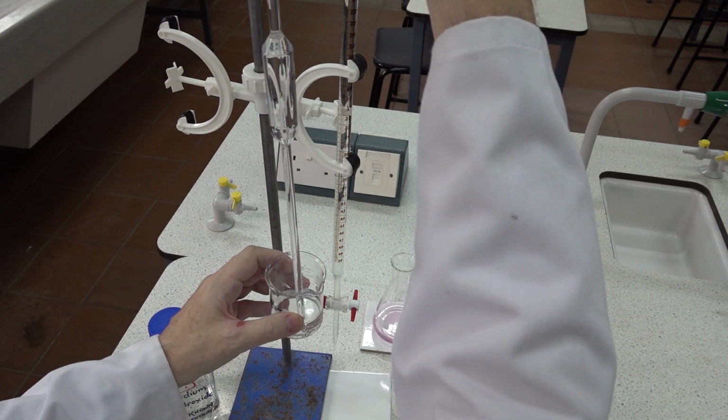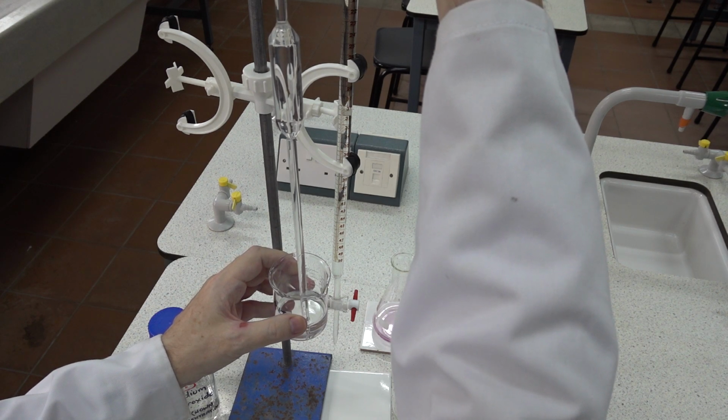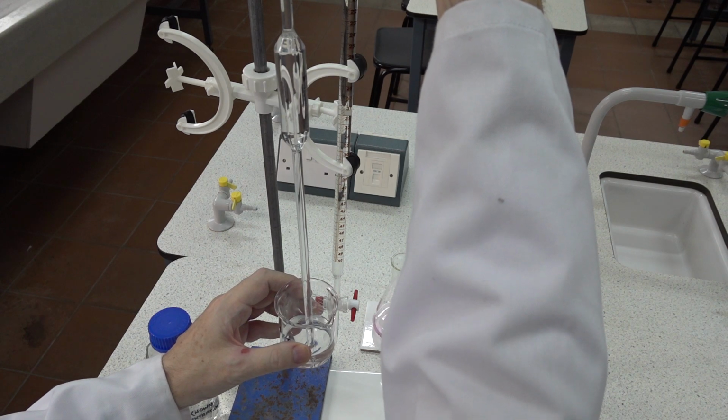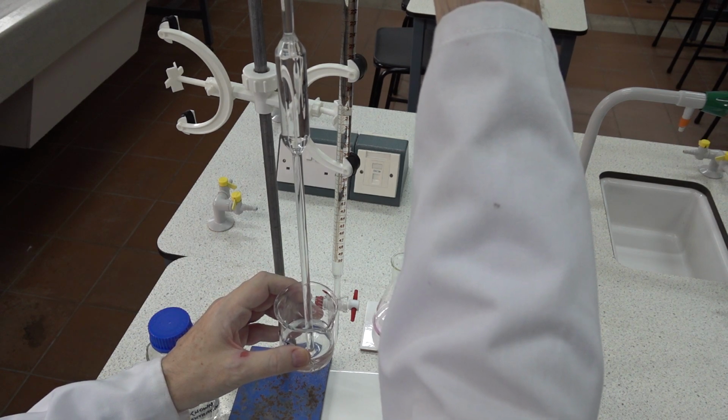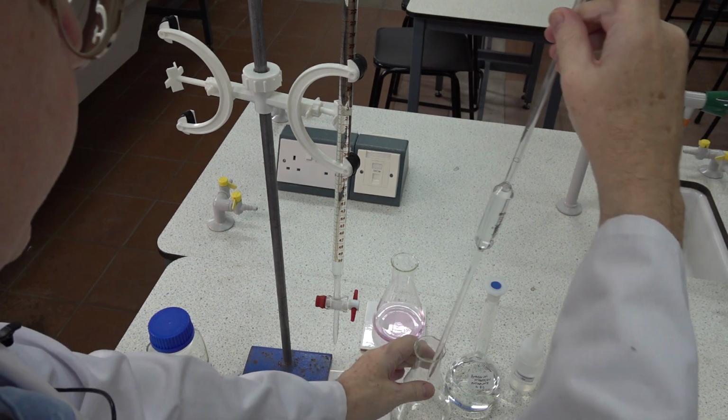You can't see the angle on the camera, until the meniscus is in line with the line on the volumetric pipette, which is there. Take the solution and run it into the conical flask.